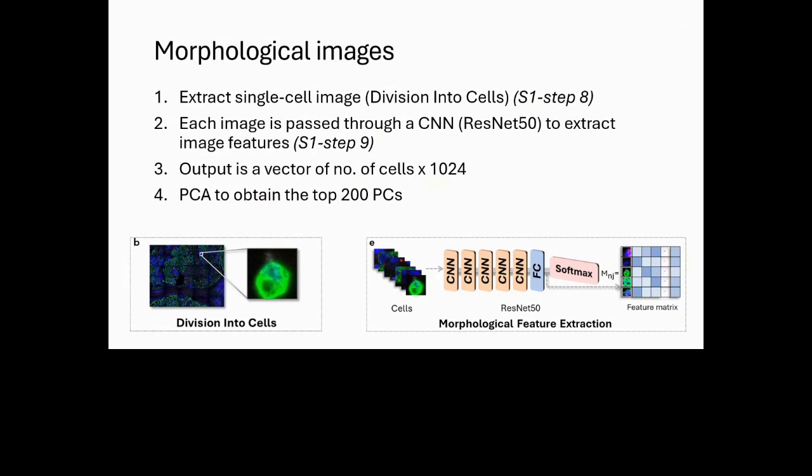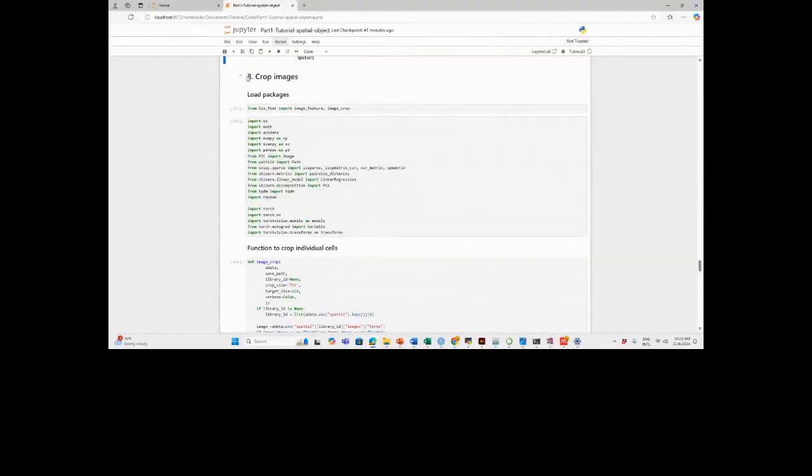So let's go back to the code. Now we're on step number 8, cropping the images. For this, we need to load the packages and the functions.